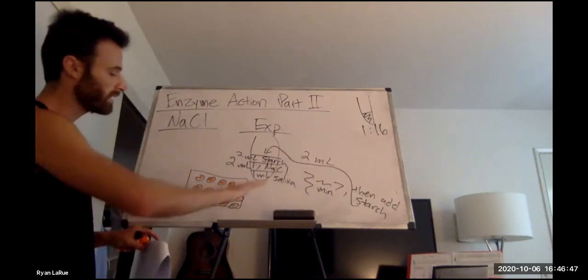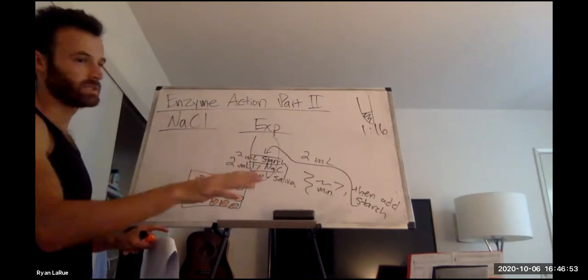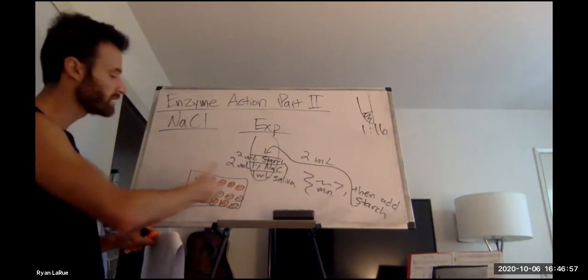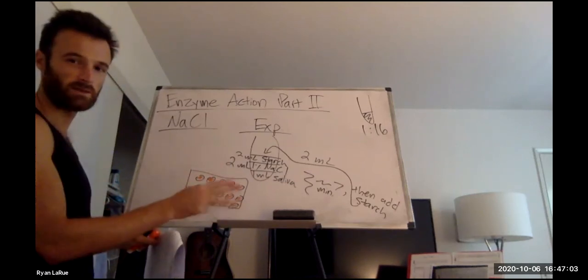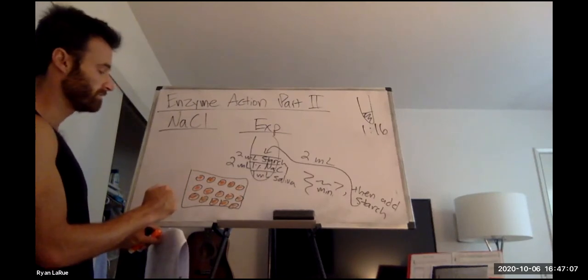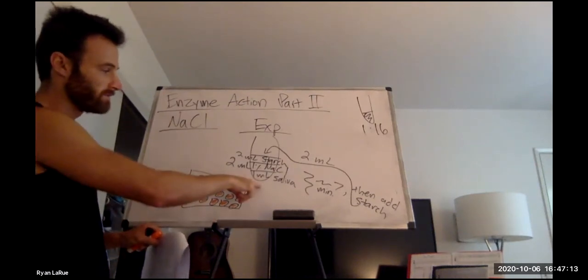And then in the second row, the positive control is just what we did last week. It's the saliva. You're just at room temperature like last week, and you expect this gradual breakdown of the starch. So the color change until the 3 wells didn't change colors, right? But then the rows further down, you're going to try this.